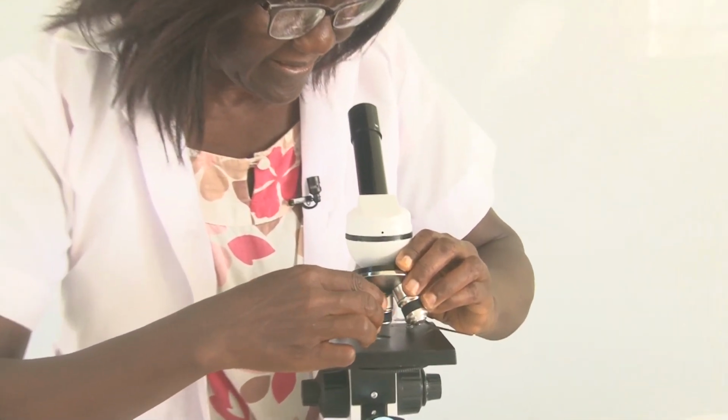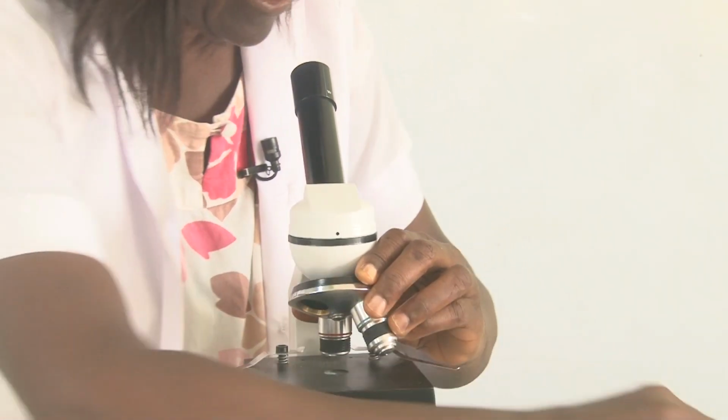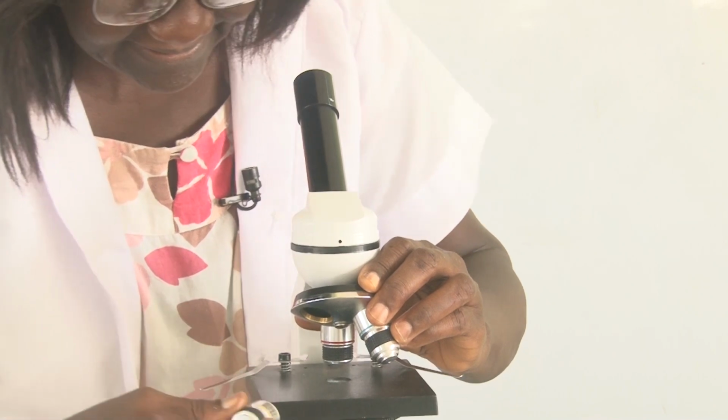Don't mess up the slide. And put back our slide. Now, we take off the oil immersion objective lens and we fix back our normal objective lens.